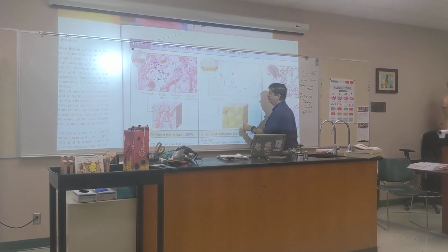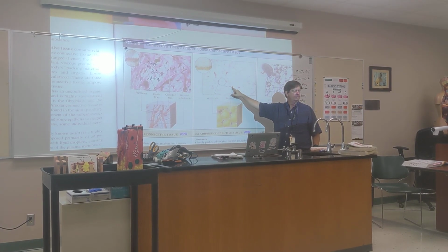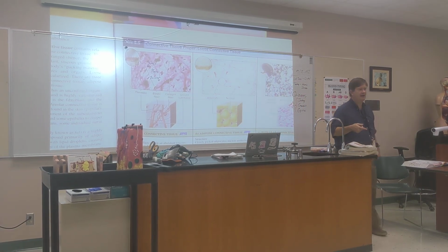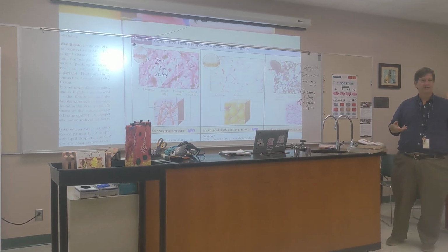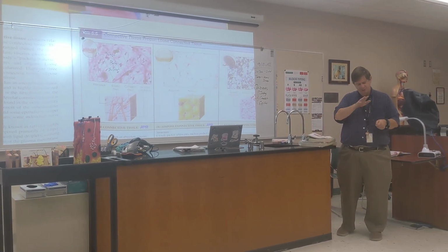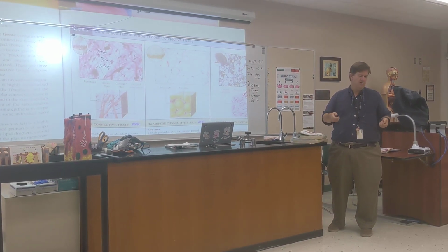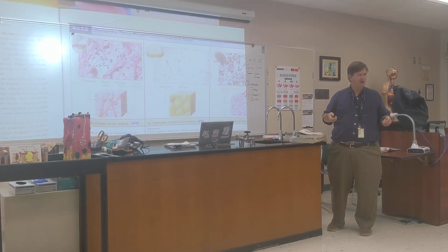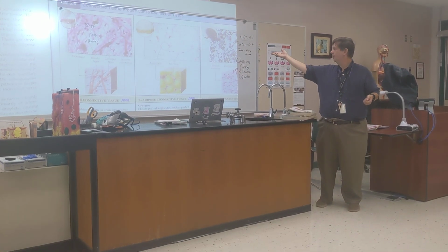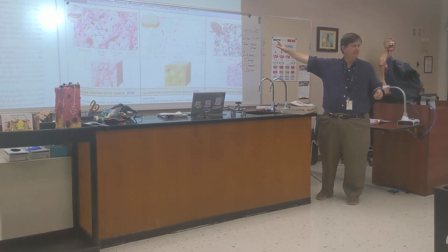That is lipid storage. The reason it looks white, do oil and water mix? No? Okay. Well, guess what? Most of the stains we use in anatomy are water-based. So, since they're dissolved in water, if you cut a piece of tissue and you put it on a microscope slide and some of it's fatty, and then you put the stain on it, you rinse off, none of it stuck. None of the stain stuck because it was dissolved in water, and water doesn't like fat. So it looks white on the slide. It's not that there's nothing there, it's full of fat. Does that make sense? Okay?